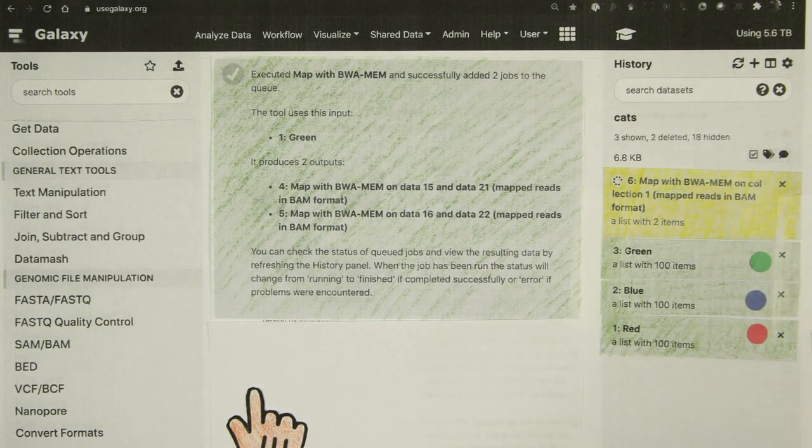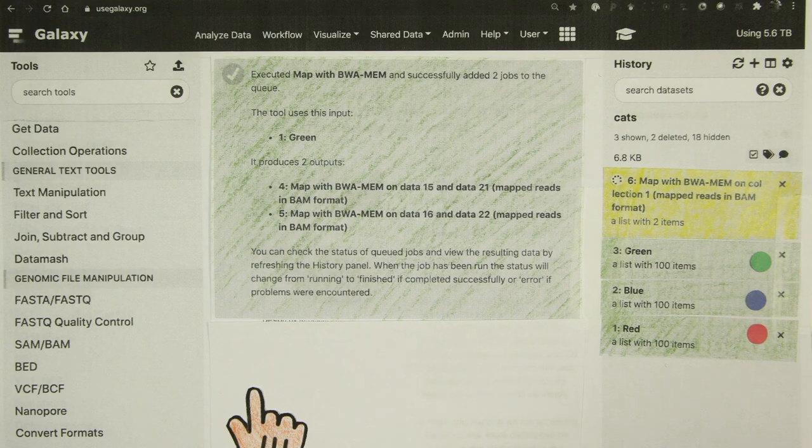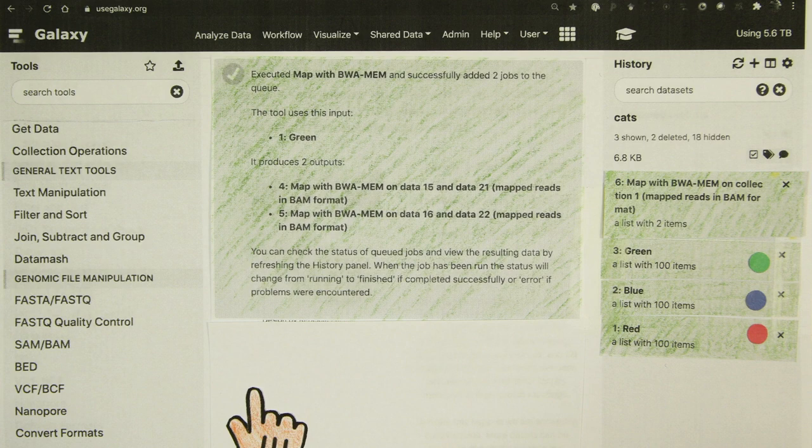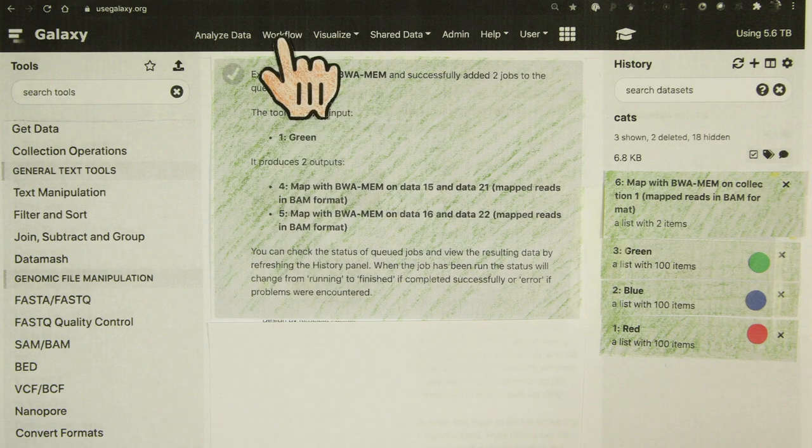And this will generate a BAM dataset. This is fantastic, but you don't do analysis with one tool. In Galaxy, you can chain multiple tools together with workflows.